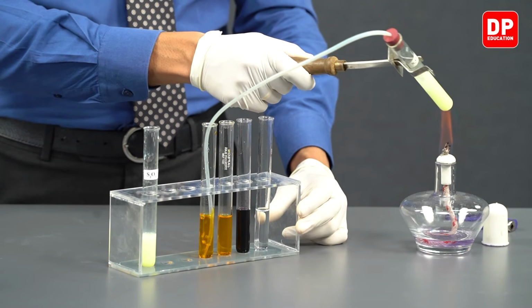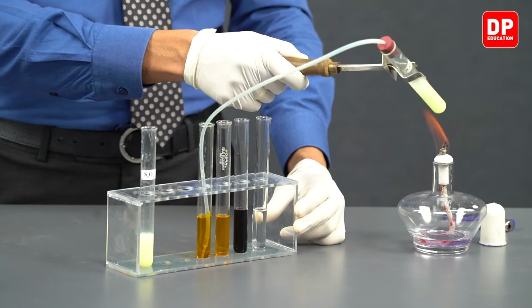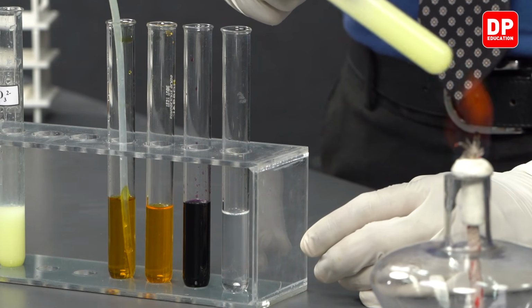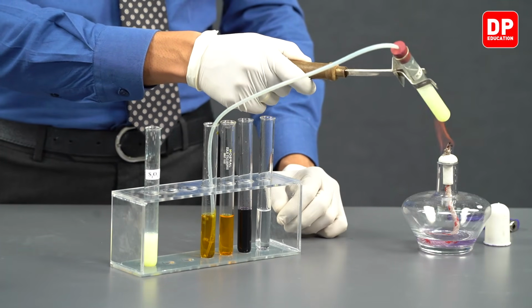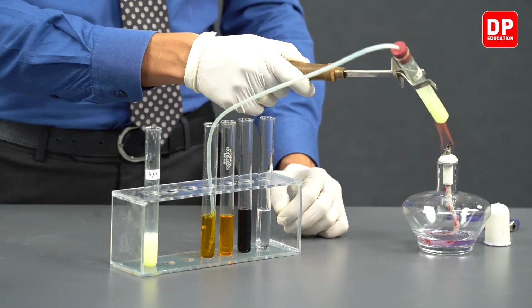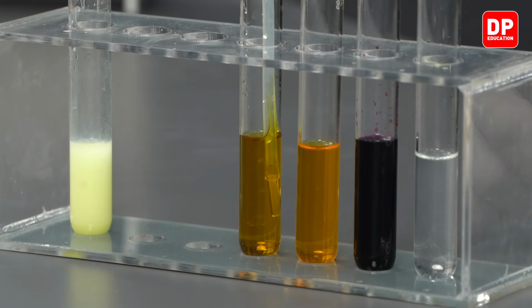You can see the acidified potassium dichromate solution gradually turns to a green color. We are heating this reaction mixture to make the reaction happen a bit faster so that we can see sulfur dioxide being produced faster, and we can observe the color change a little faster than you normally would.